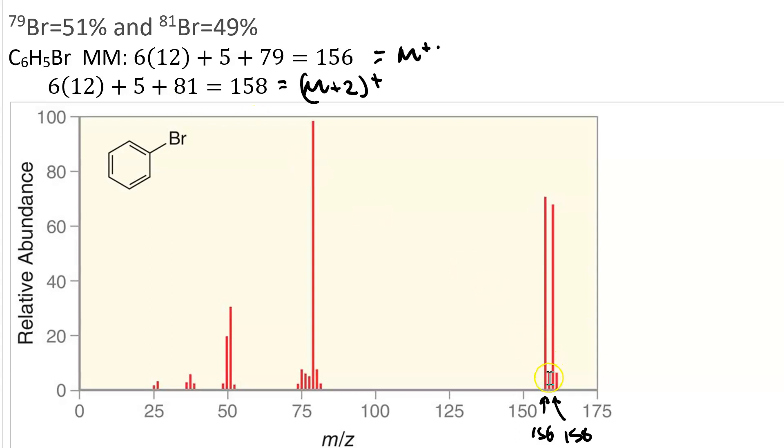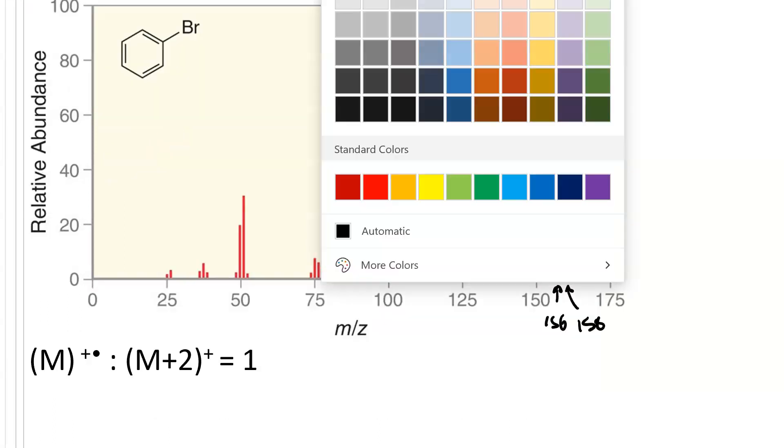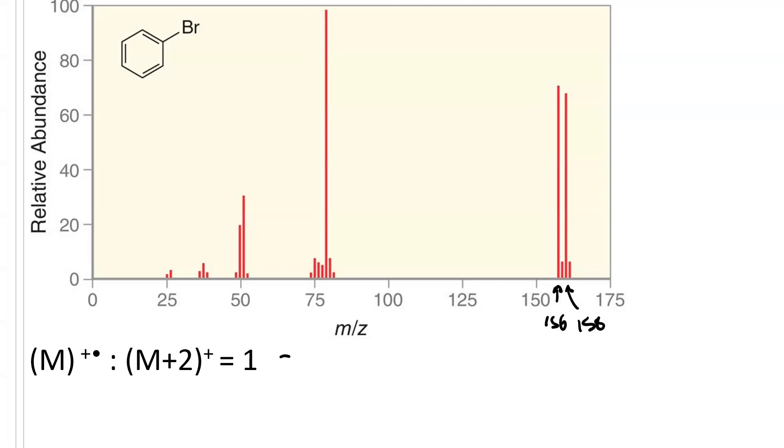Notice also that each one of these has an M plus 1 peak. There's the M plus 1 here at 157 - that's the M plus 1 for carbon-13 with bromine-79. And then you have 158 for the bromine-81, and 159 for carbon-13 in the bromine-81. When the ratio of intensities of the M peak to the M plus 2 peak is 1 to 1, that means the compound contains bromine.